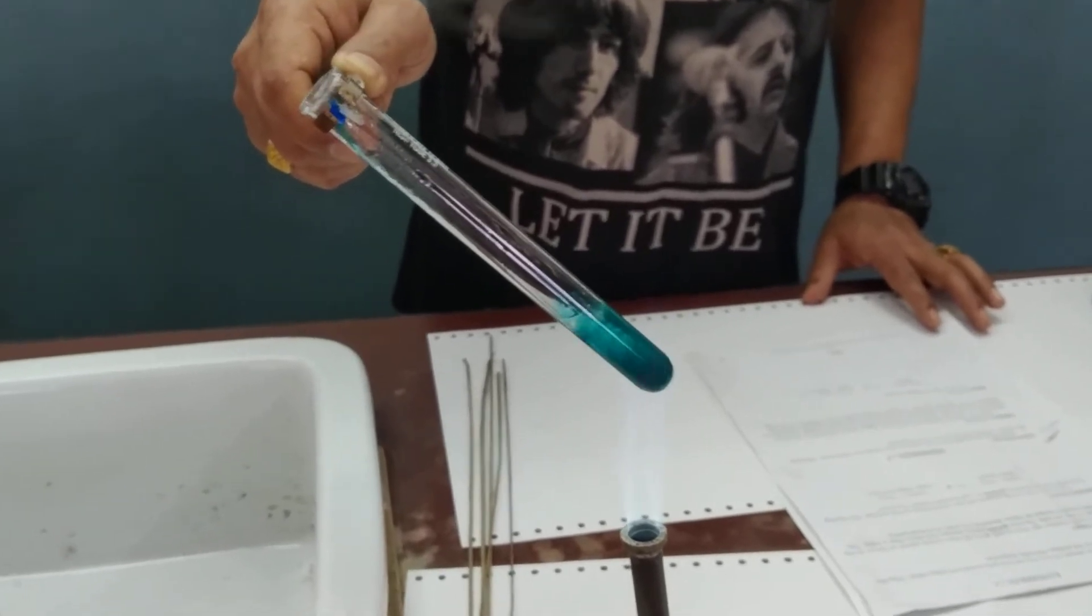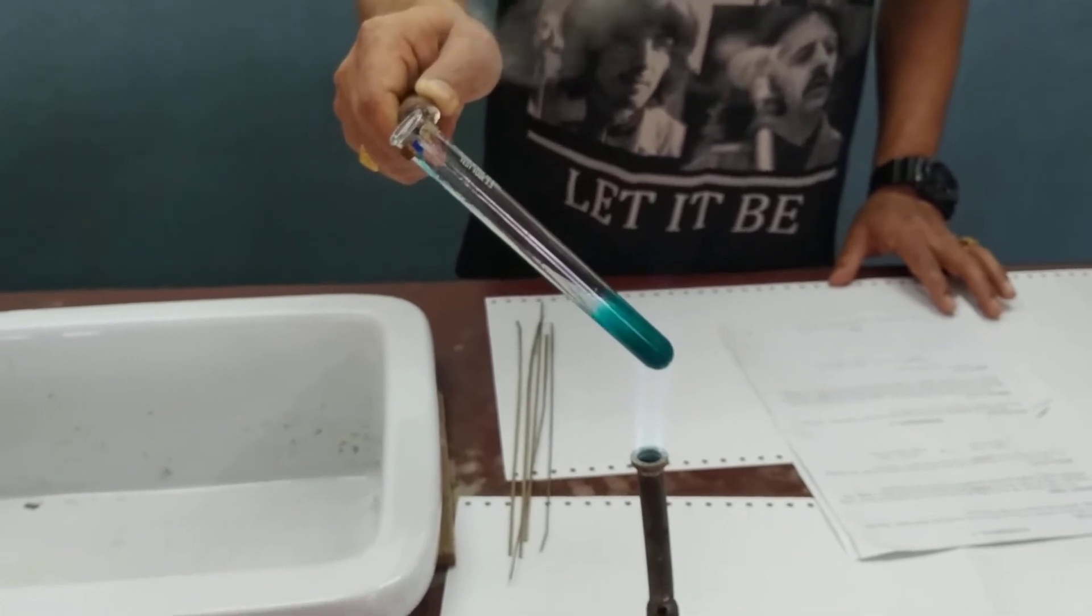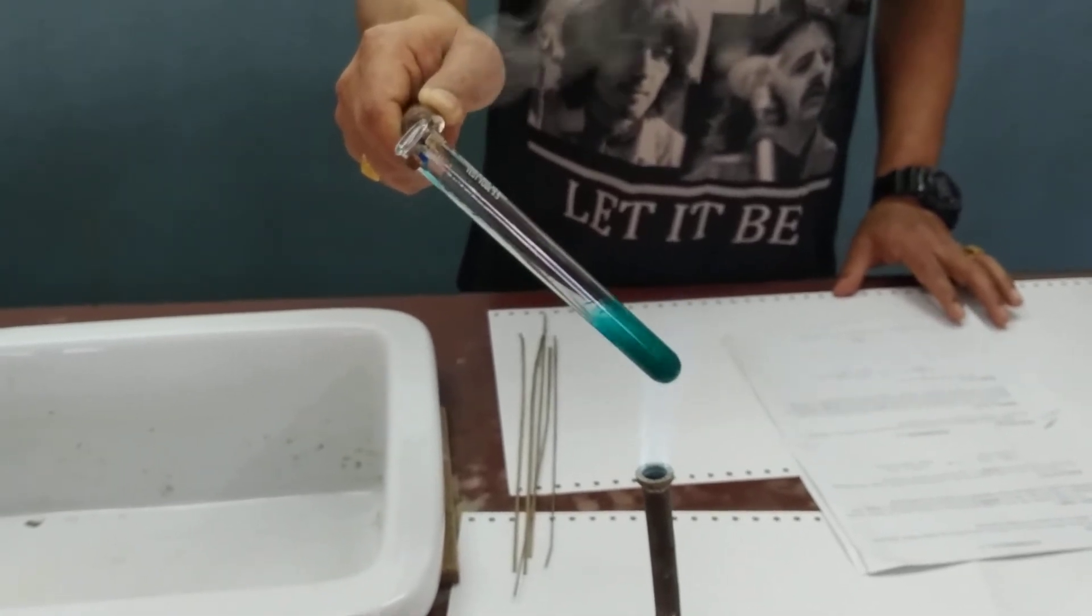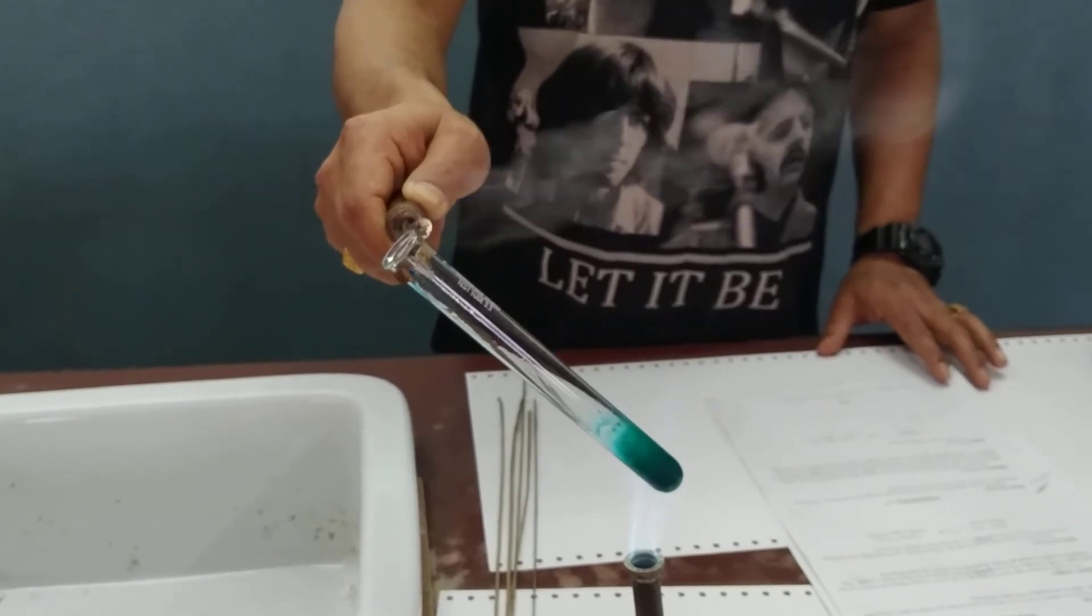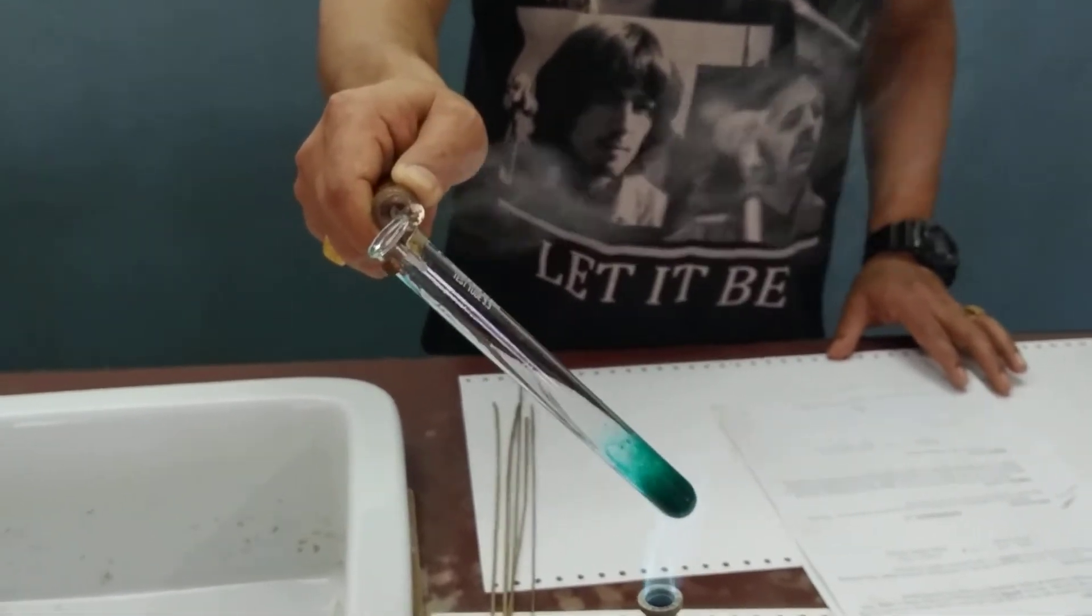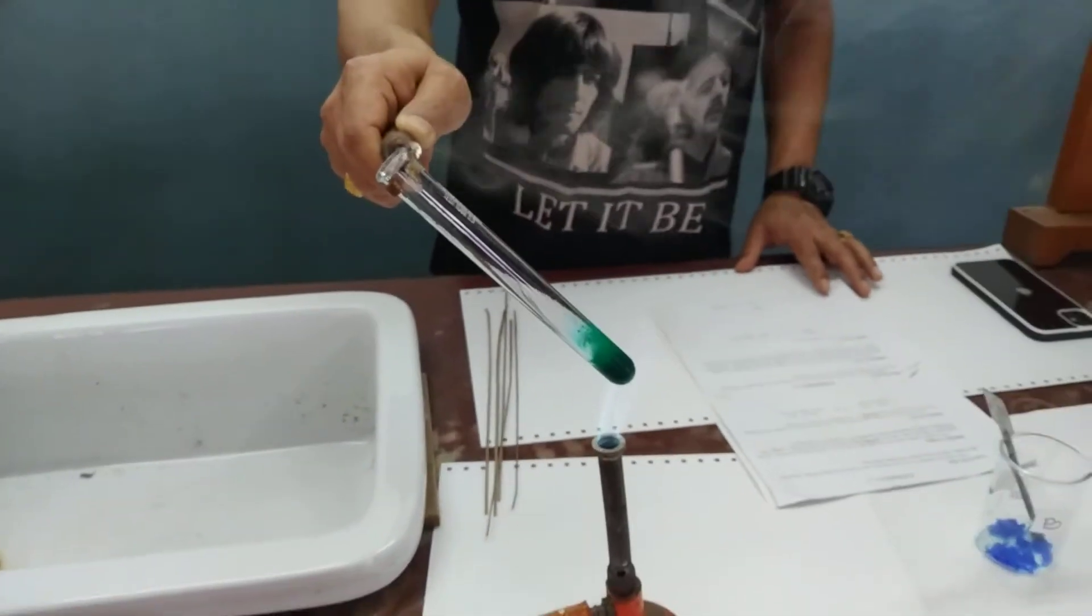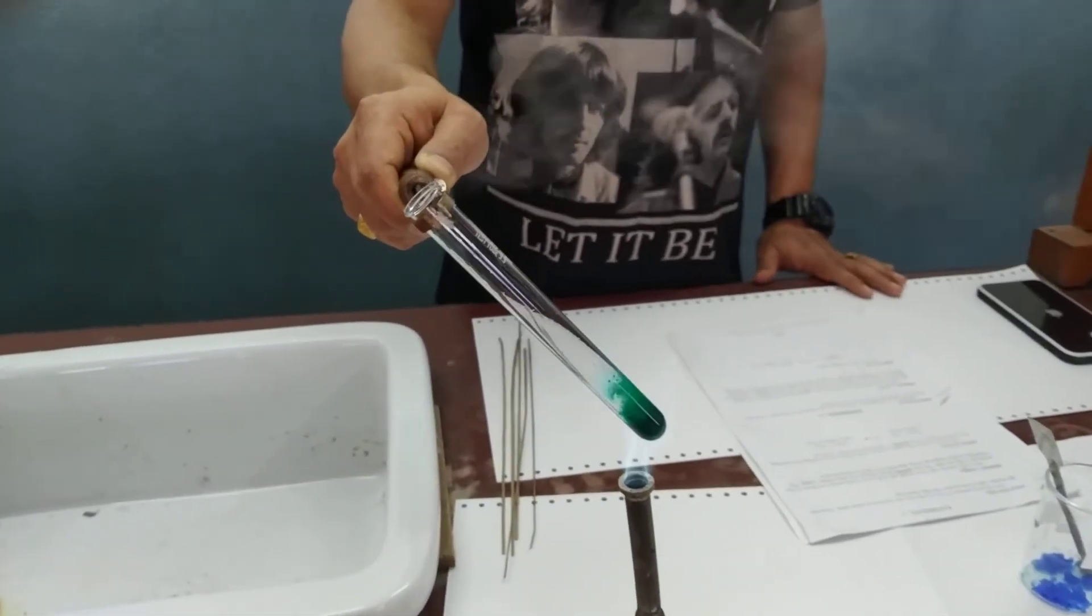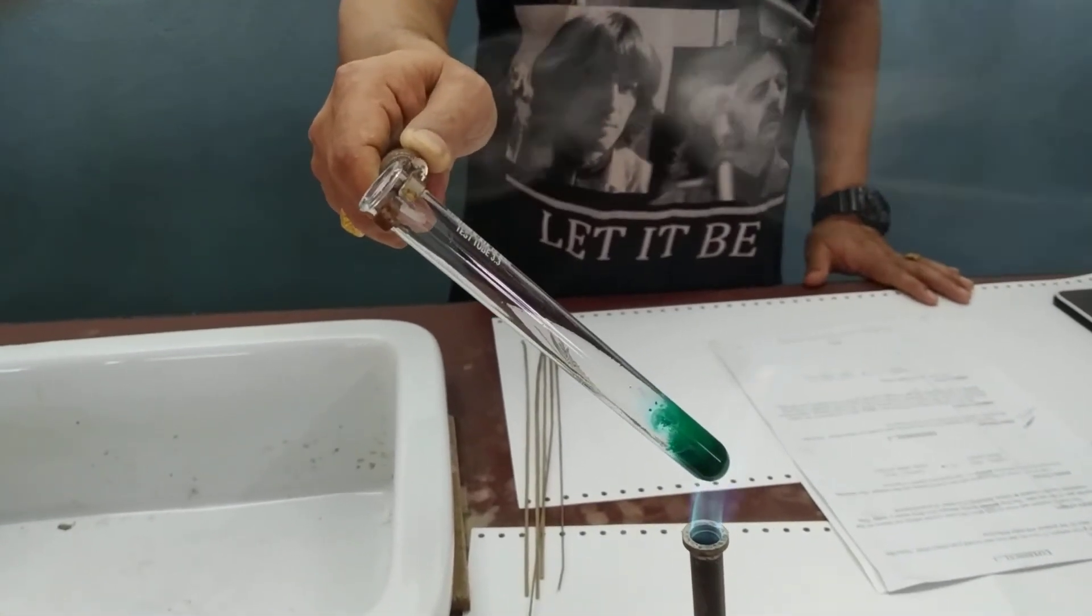On further heating, reddish brown fumes of nitrogen dioxide will be liberated. Another colorless gas which can rekindle a glowing splint will also be evolved. We are still waiting to observe these reddish brown fumes.